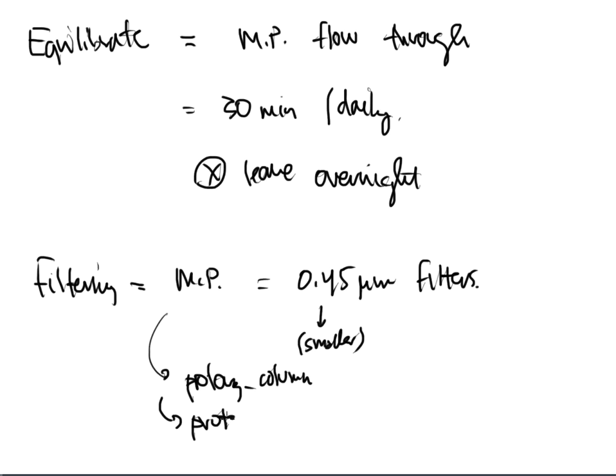And it also protects the pump. The pump is basically sucking your mobile phase through. And if your mobile phase starts to get a little slimy or contaminated, that gunk is going to go into the pump, and that pump will then become destroyed. And you'll have to take it apart, you'll have to clean it, you'll have to put it back on, all kinds of crazy stuff that you're going to have to do to the pump in order to get it to work again.